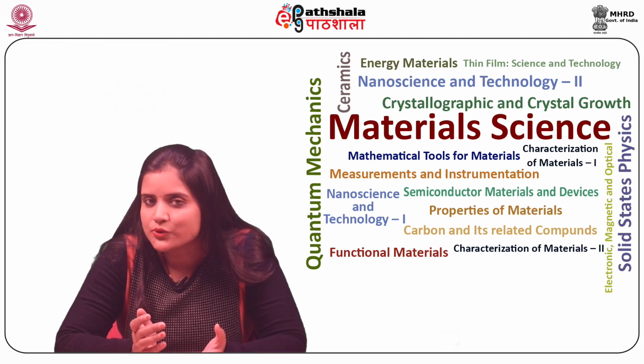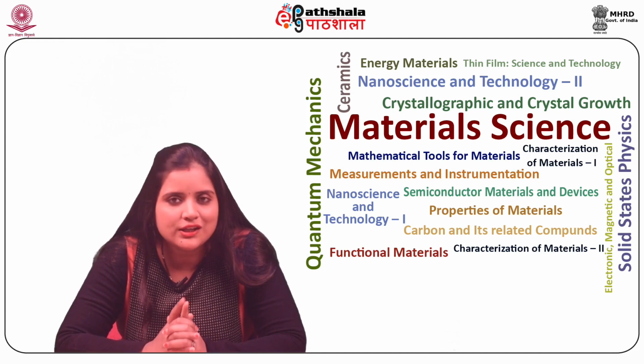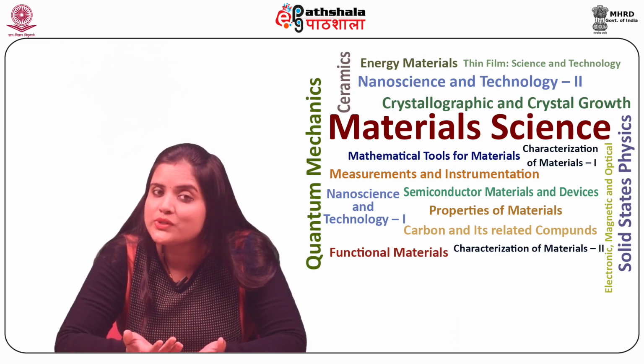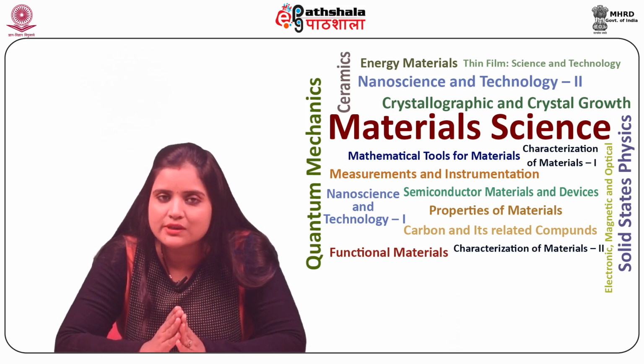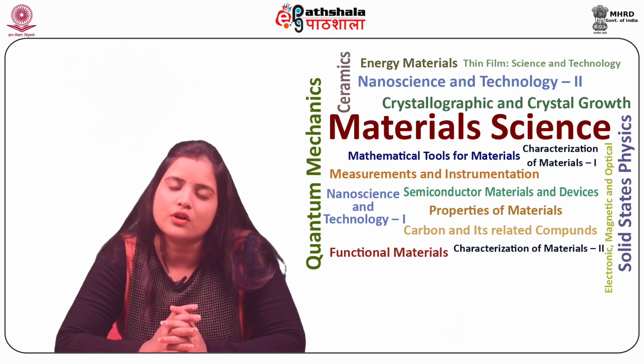Scanning probe microscopy was discovered in the early 1980s, when it stunned the world by producing the first real space images of surfaces with an unprecedented resolution at the atomic scale.